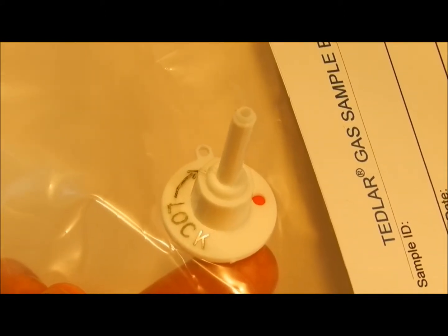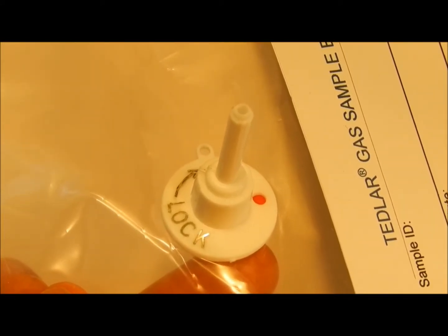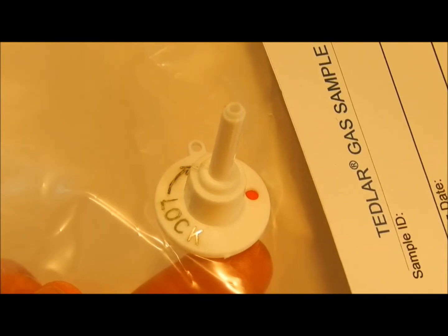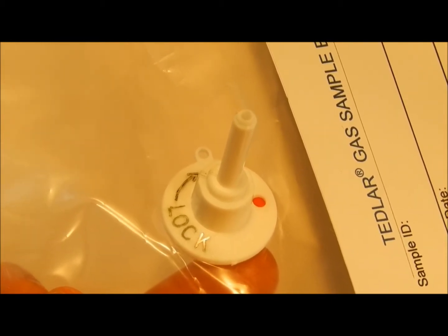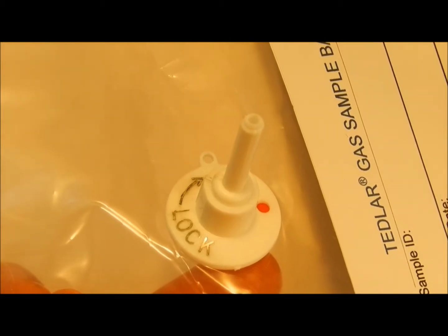This valve is the lowest cost type available and is designed for general use. The polypropylene construction is quite inert and thus it is suitable for most applications except for extremes of high temperature or high chemical reactivity.